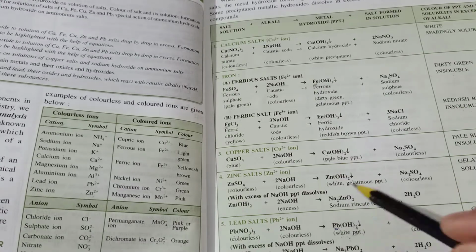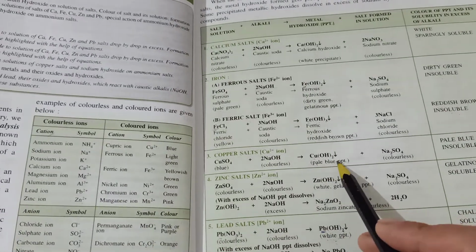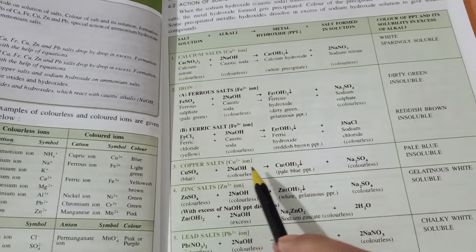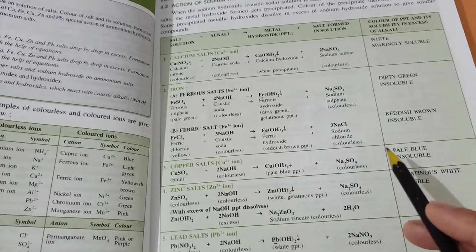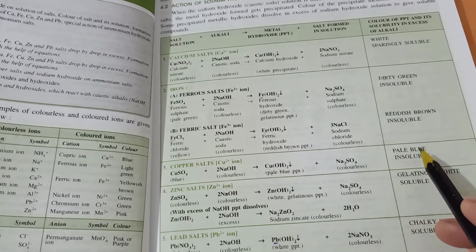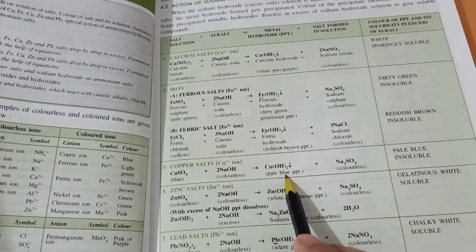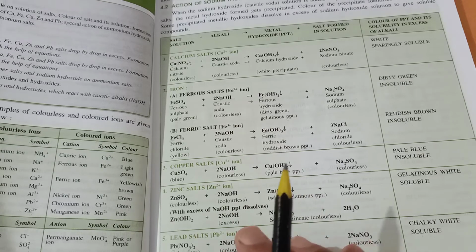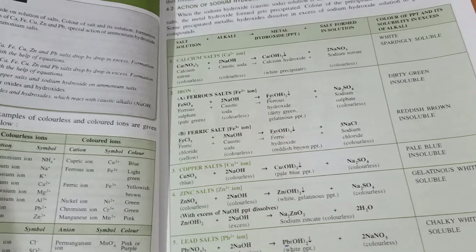But when an excess amount of sodium hydroxide is added to this precipitate, it remains insoluble. That means the pale blue color remained intact. There was no change in the precipitate formed. That means this precipitate was insoluble in excess sodium hydroxide.